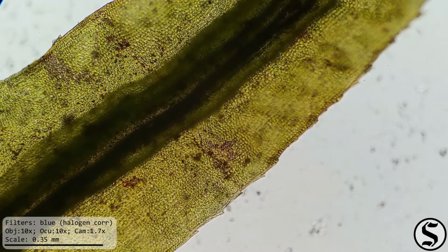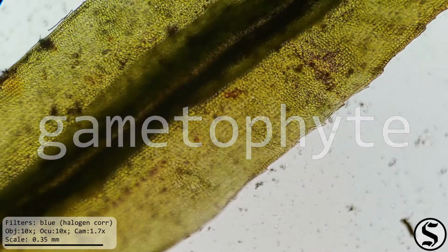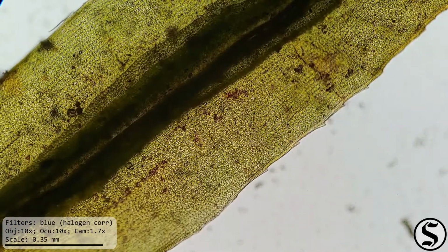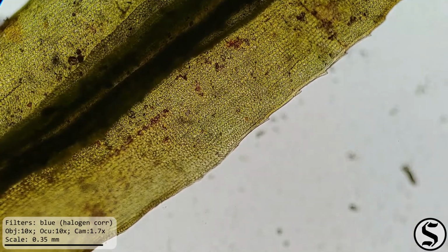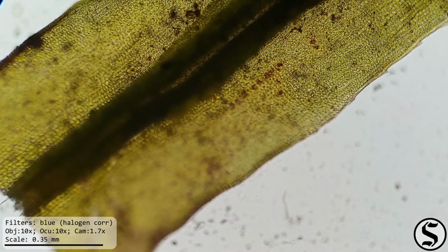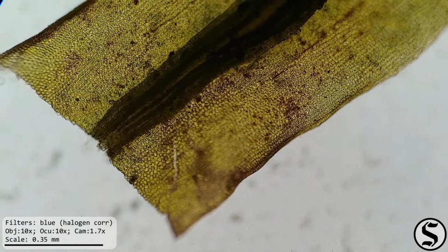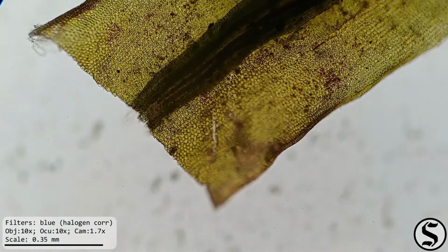Now the leaf comes off of the gametophyte part of the moss. That's the part that's responsible for the early stages of reproduction. That comes from the Greek gamos, marriage, and phyton again still means plant. So the gametophyte is the marriage plant.